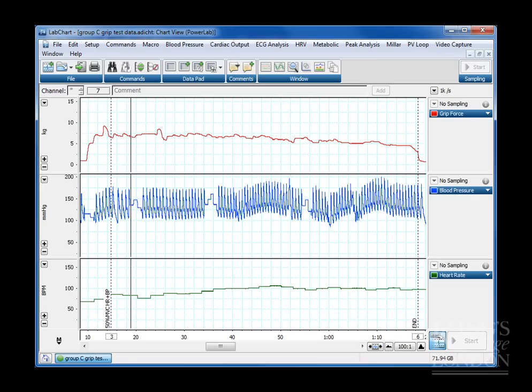Hello and welcome to the first in the tutorial on use of LabChart, LabChart Pro, LabChart Reader, and Microsoft Excel to do data analysis of human physiology practicals. This is a tutorial set designed for both BSc and MSc students.